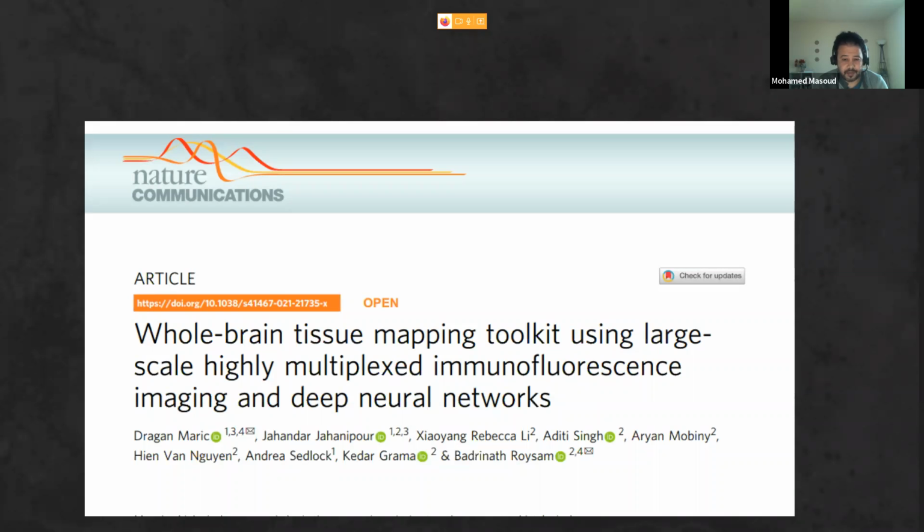There are different stages this paper tries to describe. One of them is overcoming the problem that brain tissue is considered large scale compared to other tissues of the body.